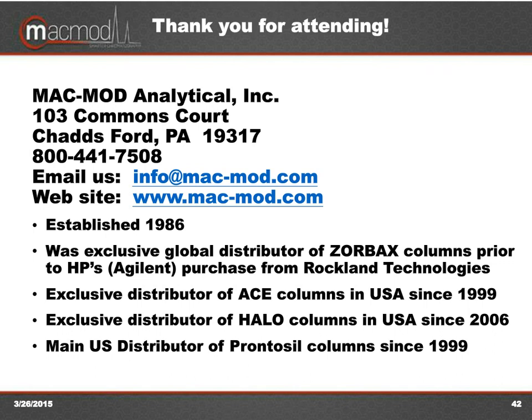then once you have that information, you would use those conditions, and probably those conditions only, to proceed with evaluating in a systematic and empirical way which is the best place to work and what knobs you can turn within those constraints relative to your signal. But I'm not aware of any guide or flow chart or whatever, but I'd be happy to discuss that with the person afterward or by email or otherwise.